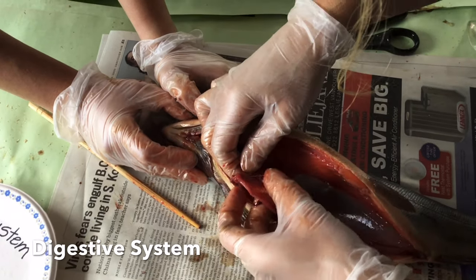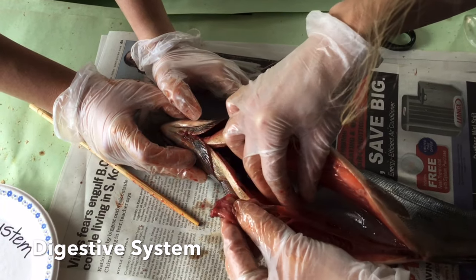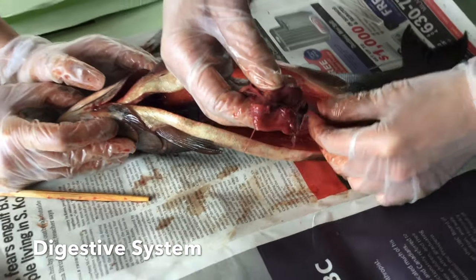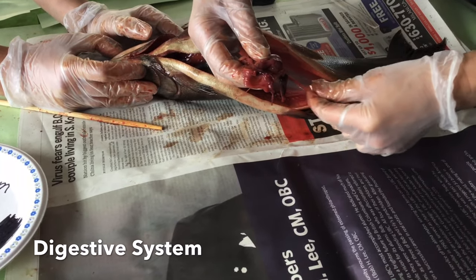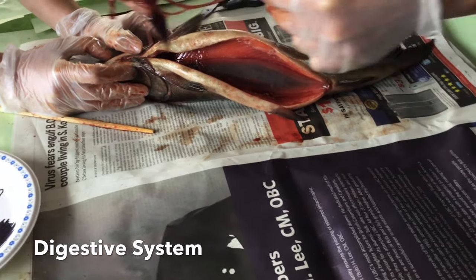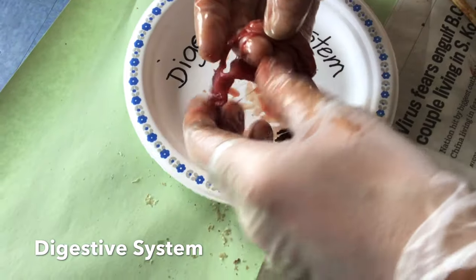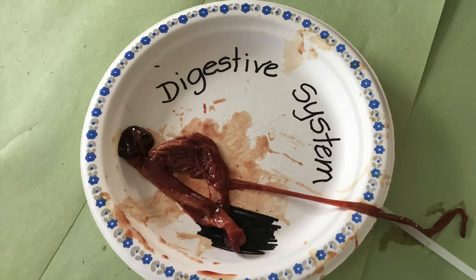Oh, the swim bladder. Good. You just have to detach that. So you can see here the duct. This is the large intestine that connects out to the vent. Okay, so here's the entire digestive tract of the salmon. And then we'll go through the individual parts.